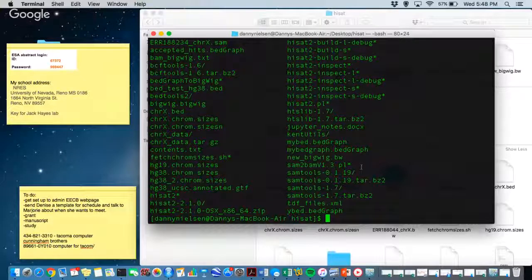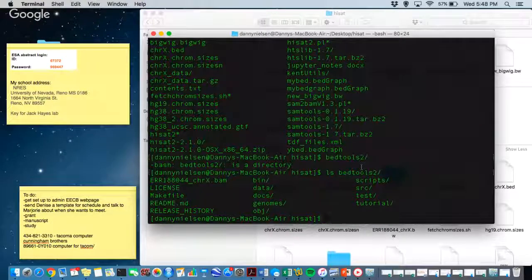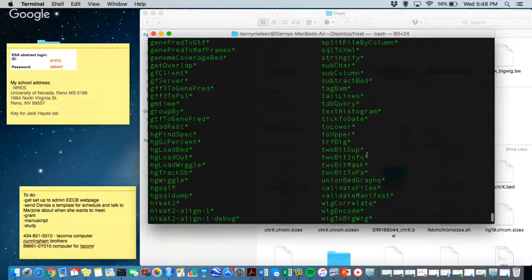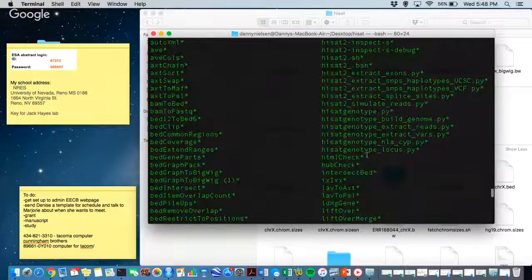All right. I did this earlier and it worked fine. So let's see. BAM to bed.